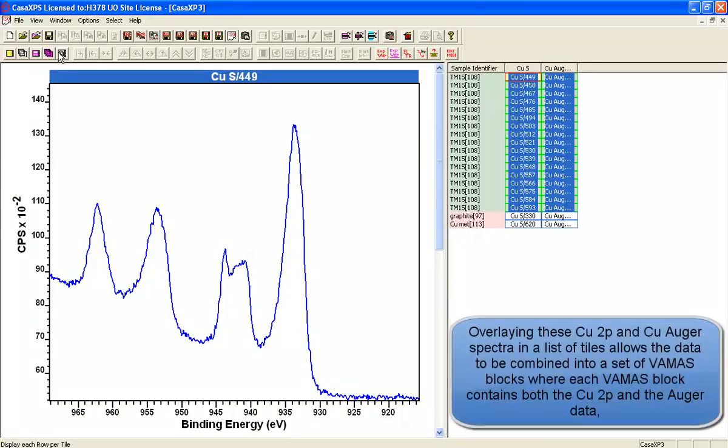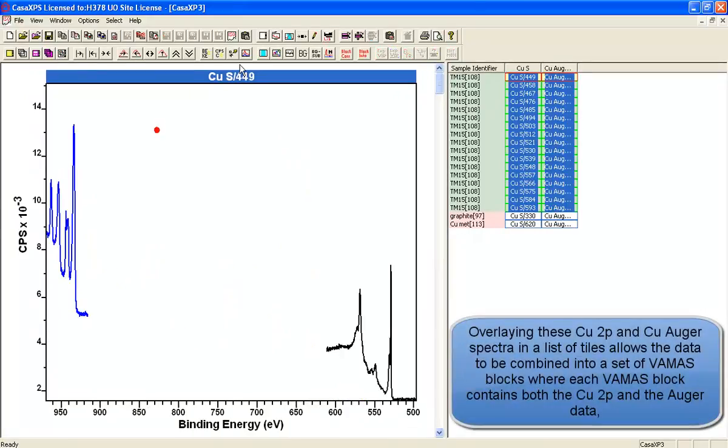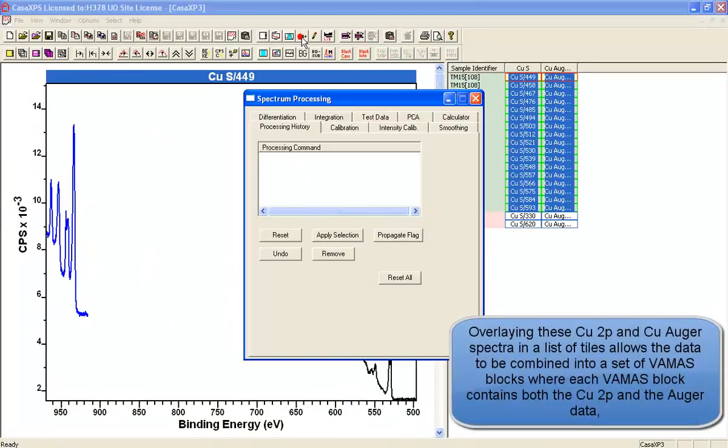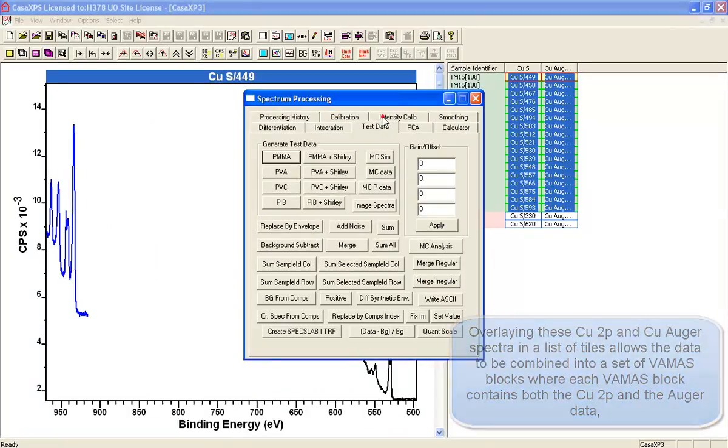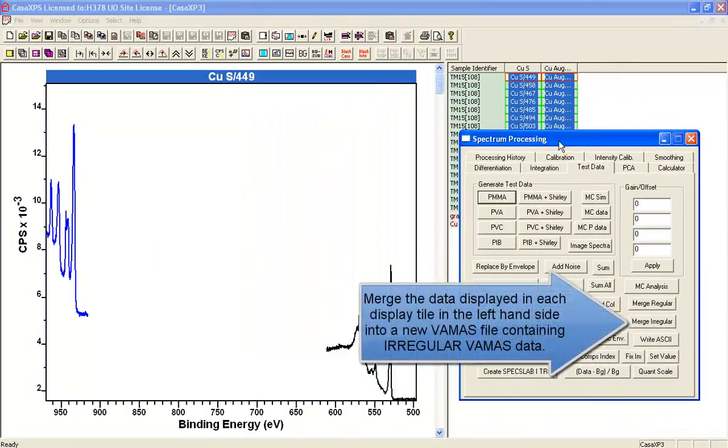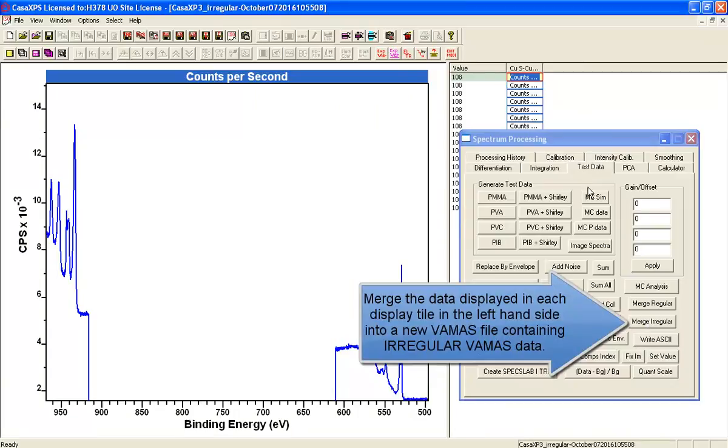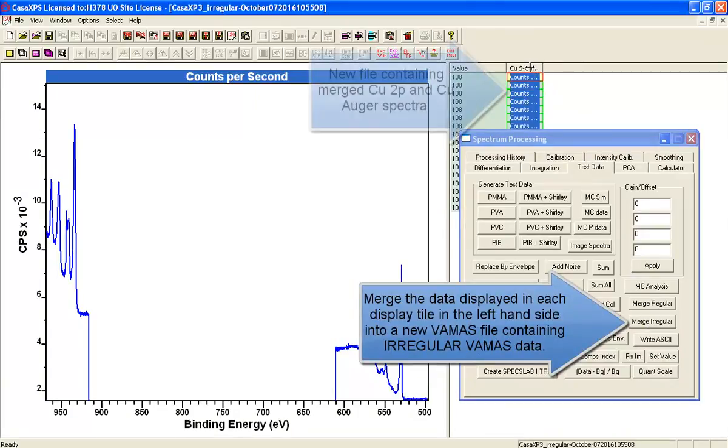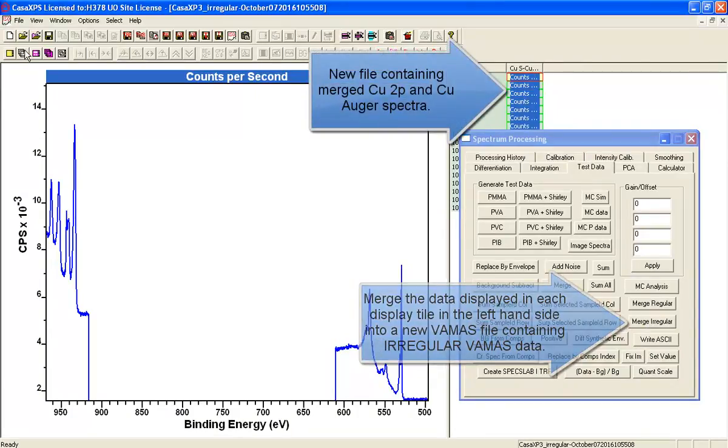And in order to monitor how these changes occur, we're going to look at the copper 2p doublet and also the copper Auger and oxygen 1s peaks.